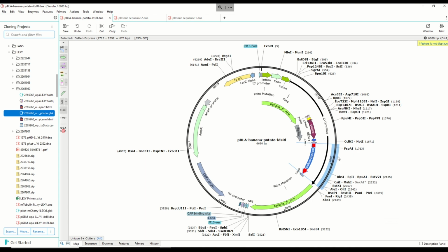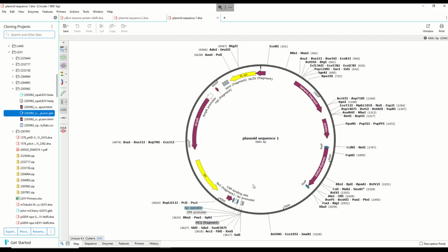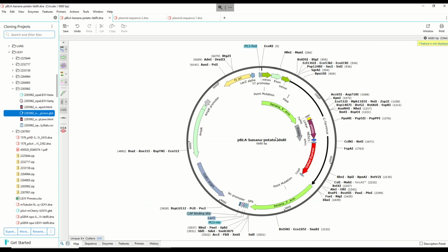And so then you do sequencing. If you do whole plasmid sequencing, which is the thing now, which is actually just high throughput sequencing on plasmid, then you get a nice auto-annotated map like these do. And if you do regular Sanger sequencing, then you get sequences that way as well, right? Either way, you just take those sequences. If you have them open, it makes it easier, but you don't actually have to have them open.